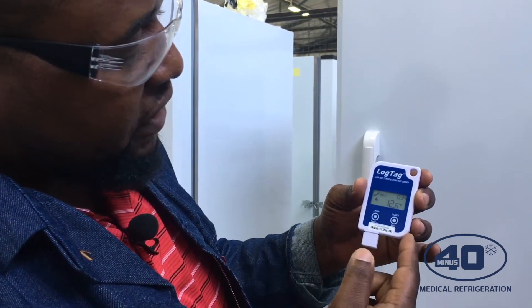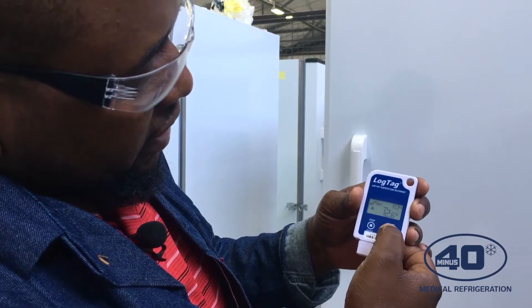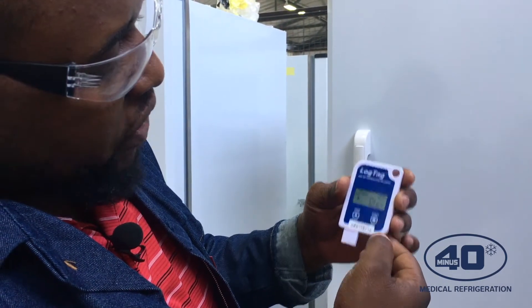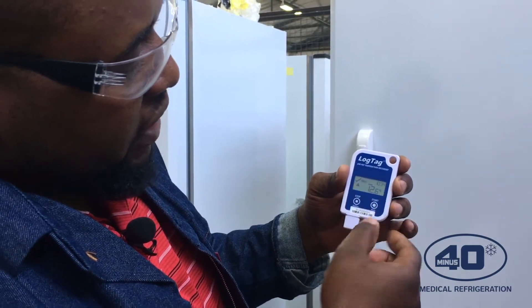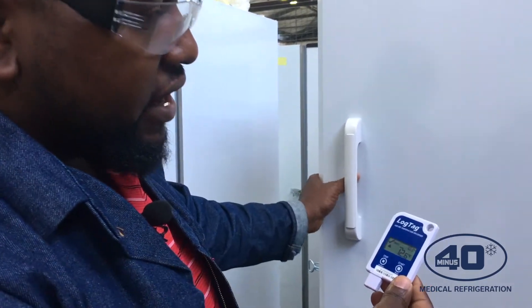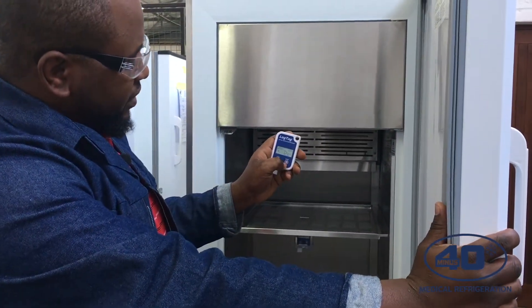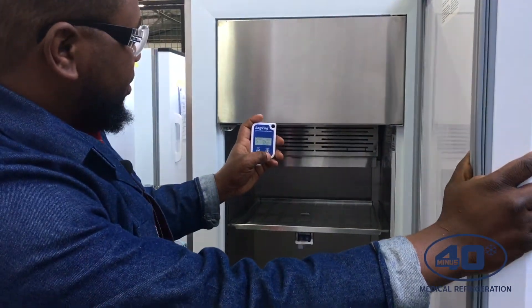Anytime you press Start, you will see a REC appearing on the screen. When you pull the report, you will be able to see that on that particular day and time a check was done — so that is just a quality check. During your reporting, you will be able to see that every time someone pressed the Start key, it shows that someone manually checked the temperature.